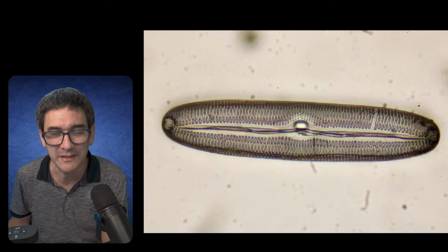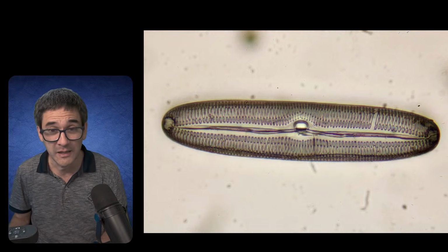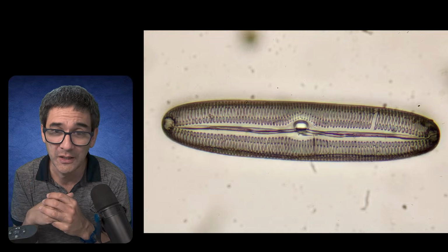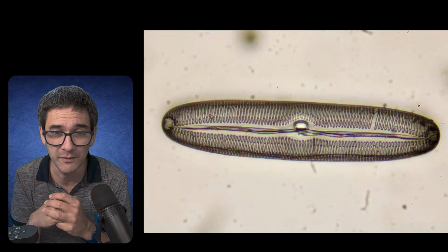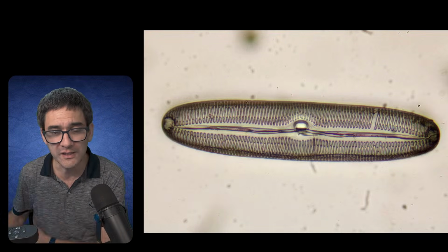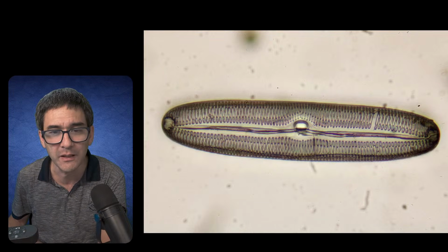Very nice looking. And that's actually what I wanted to do as well: if I'm able to make a collection of those pictures, then we'd have a nice identification book. Is this focus stacked? I'll quickly check the email. Just a second.